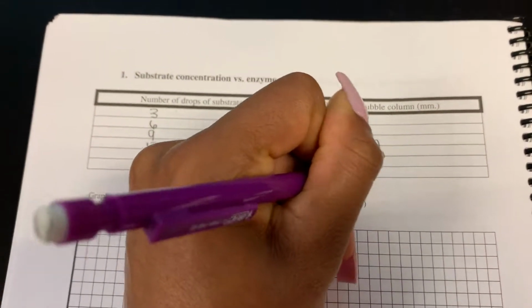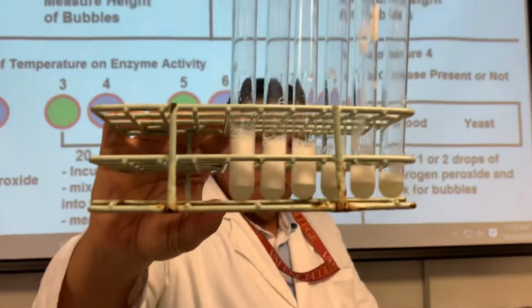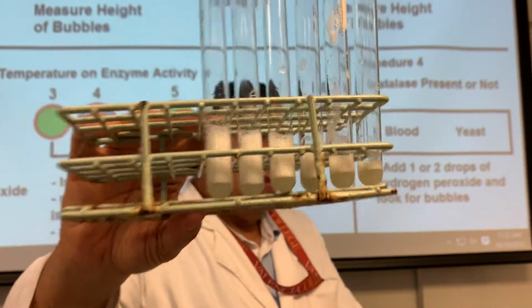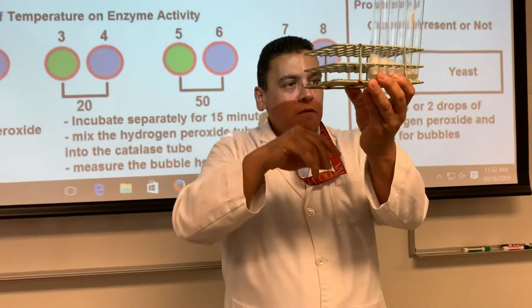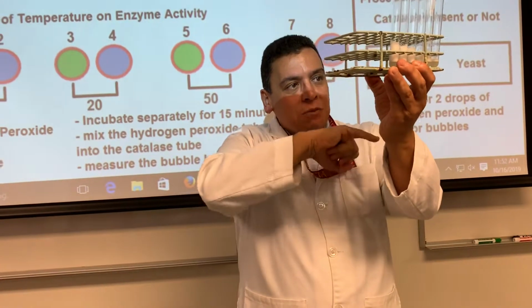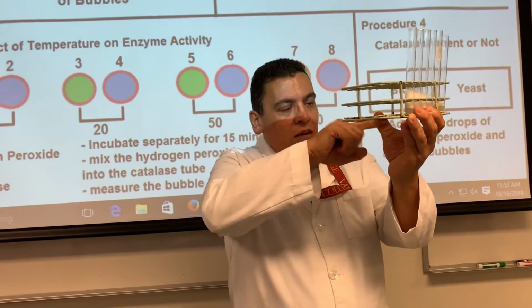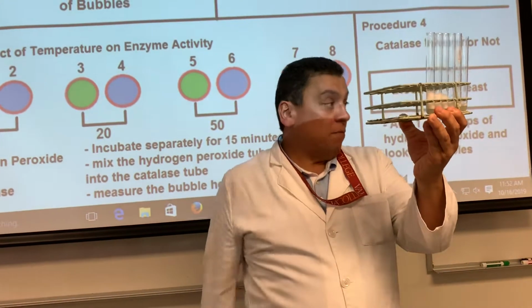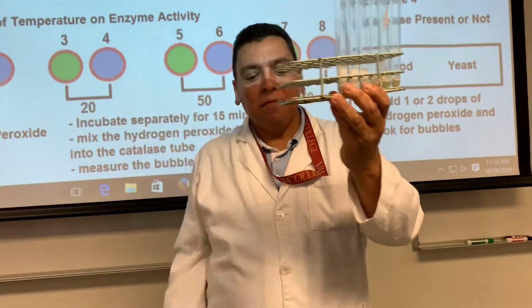Watch this. Here's your graph. There's your graph. You see it? When you eventually graph it by next week, you're going to graph it hopefully right away when you get home, but you hand it in next week, it's going to look just like that. Wait, does it have to be a bar graph or a line graph? No, all your graphs are line graphs. I'm glad you asked me that. It's going to look exactly like that.